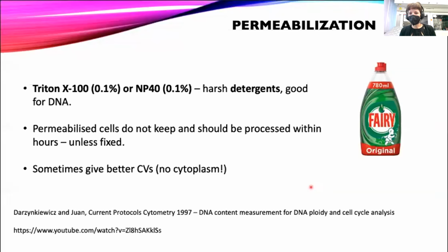Brian Hanley is asking, does the amount of time spent in formaldehyde fixative affect the autofluorescence, and does this saturate over time? Well, the first part of that, yes, is definitely true. One of the reasons why I do the fixation and then wash it off is because the longer you leave things in formaldehyde, the more the autofluorescence increases. I've never actually done the experiment to see where it saturates because I'm too scared to do that.